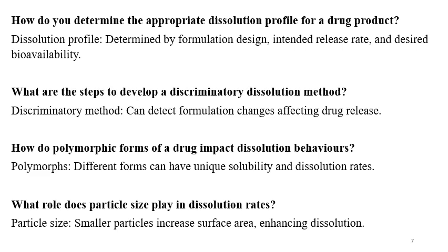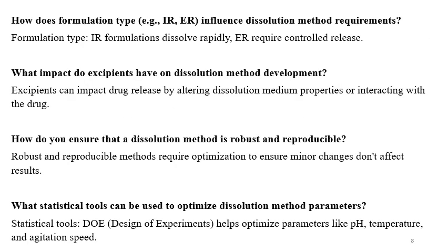What role does particle size play in dissolution rates? So smaller particles have increased surface area, and that's why they show faster drug release, while the coarser material have less surface area and it is slow in the drug release or dissolution rate.